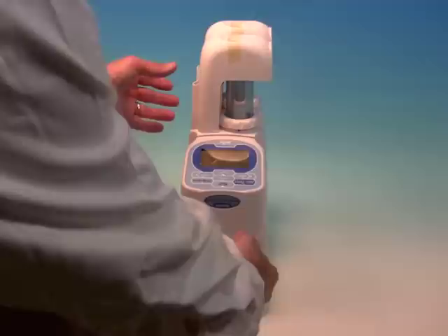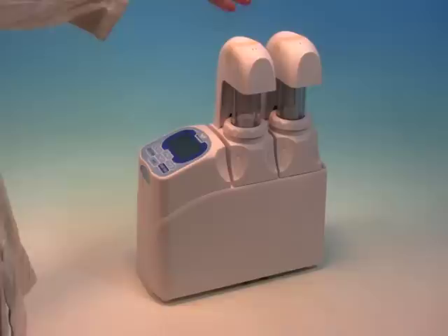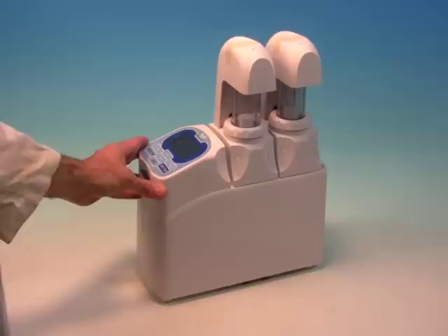This is the AT700 Potentiometric Automatic Titrator. It's a compact unit with a lot of capability. The instrument comes standard with one burette but can be easily expanded to include a second burette. This is a great feature when you're running two tests and want to swap between them on the fly.